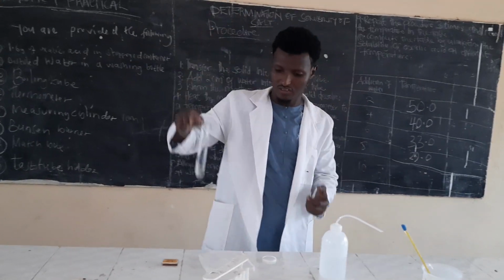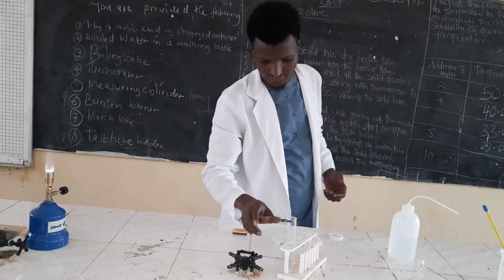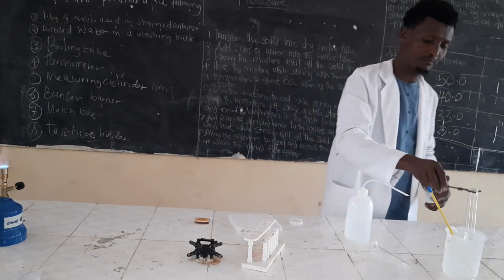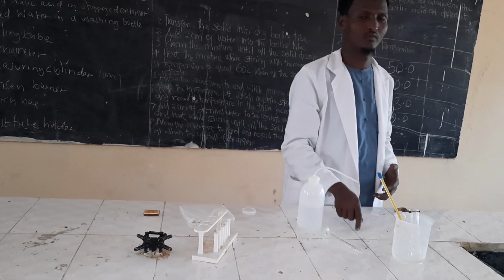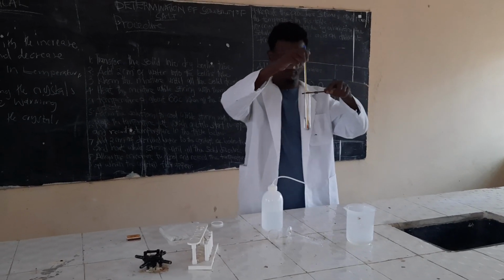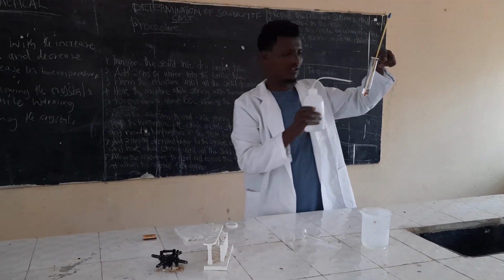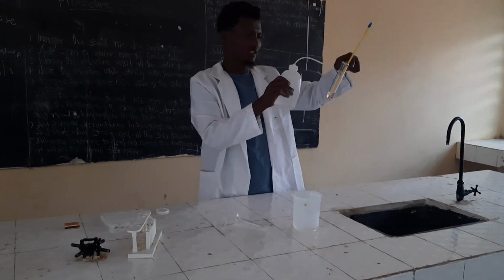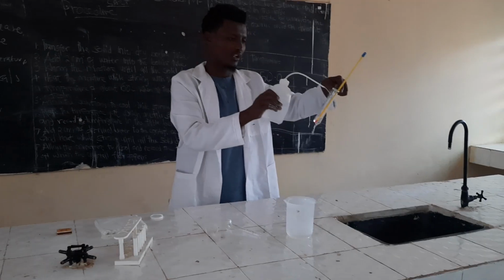I have heated the solid. Good. Allow it to cool now. Not yet. This one takes a lot of time.